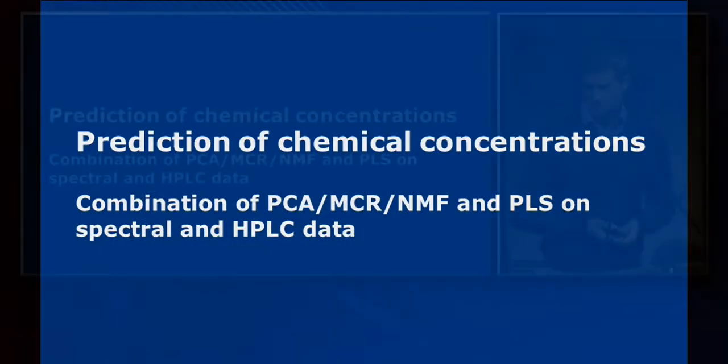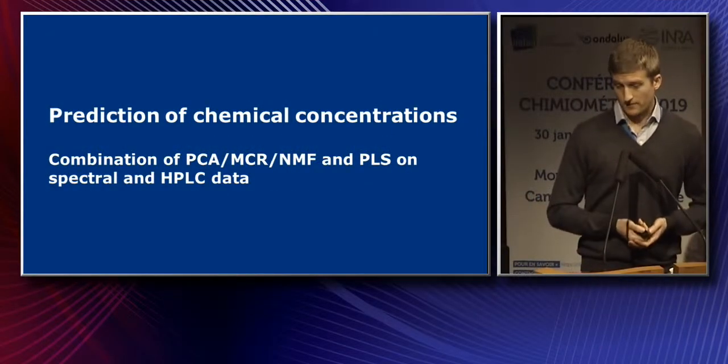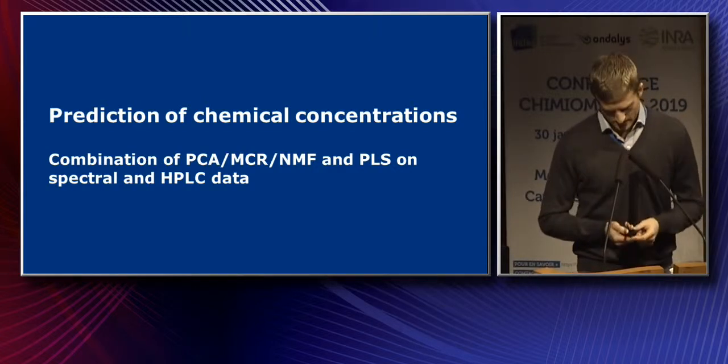So the last section is here to predict chemical concentrations by applying a combination of PCA, MCR, NMF, and PLS on spectral and HPLC data.